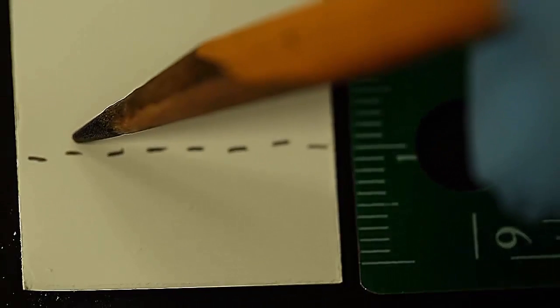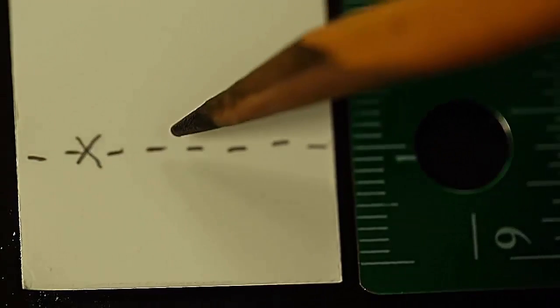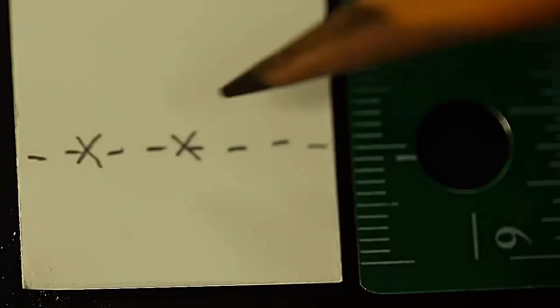Always use pencil when making the markings on the plate, because the ink of a pen has organic dyes, which would complicate the analysis by providing additional compounds that run on the TLC.